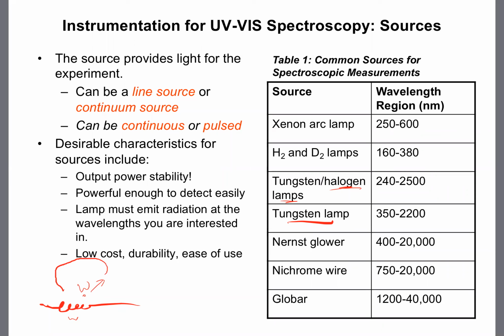But instead, they form this other gas that diffuses back to the surface where it actually decomposes and the tungsten redeposits on the surface. It's kind of like a recycling approach. Well, anyway, if you do that, you can get a little bit hotter lamp. And because of that, you can get a little bit further down into the UV, but still not a great UV source.